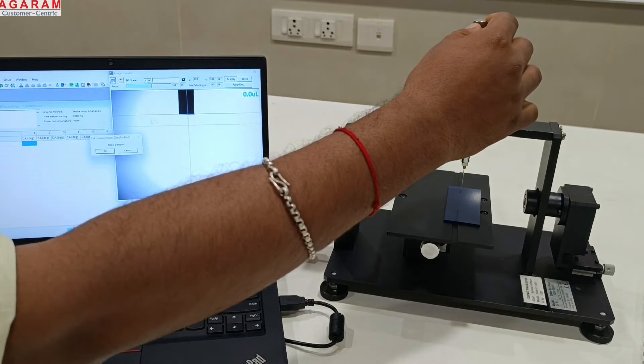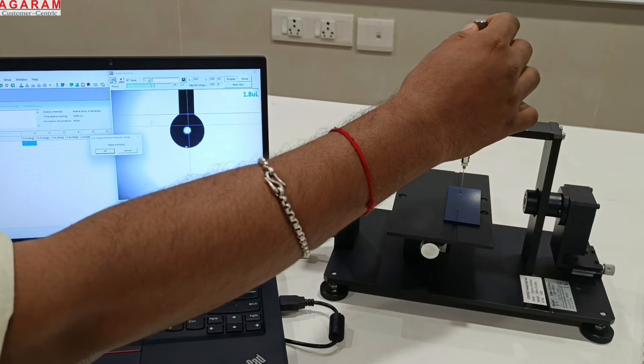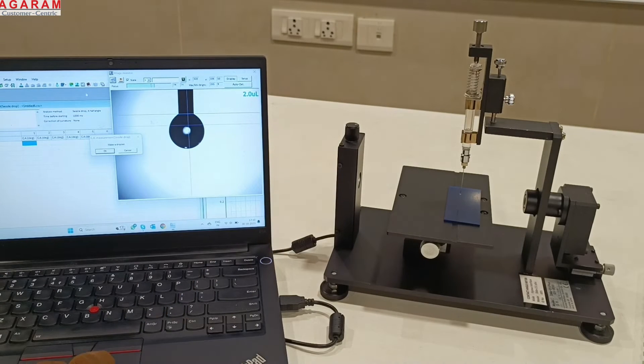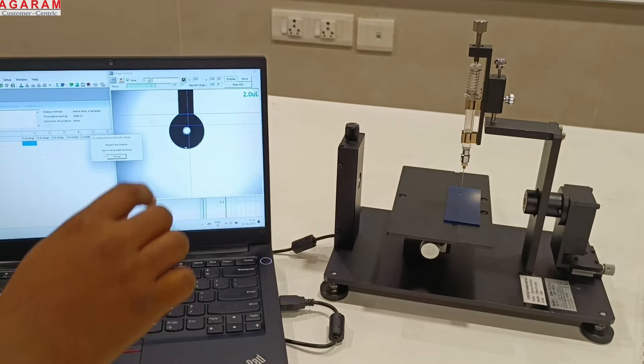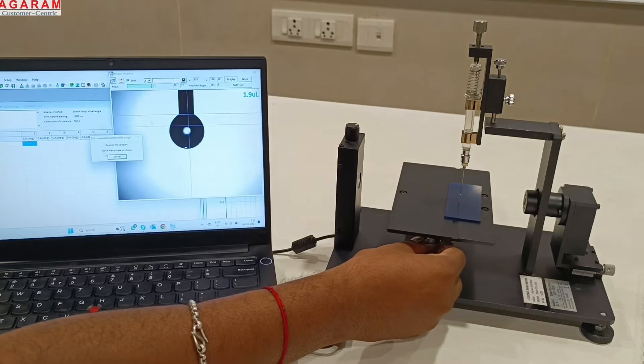Click measure button on the FAMAS software. Create a droplet by operating the thumbscrew. You can control the volume with precision of up to 0.1 microliter. Now deposit the droplet on the solid surface by moving the sample stage up.